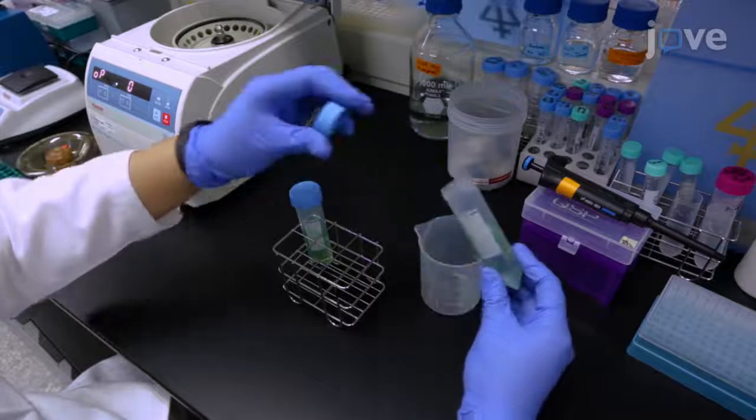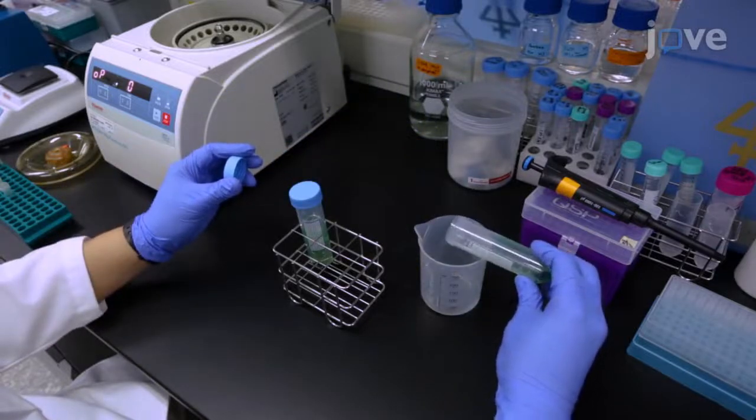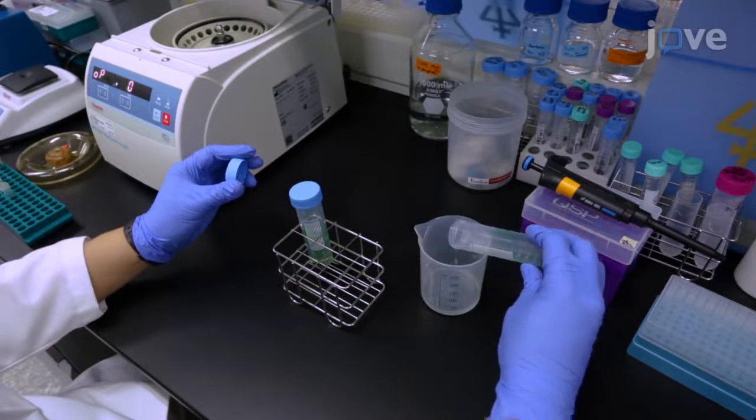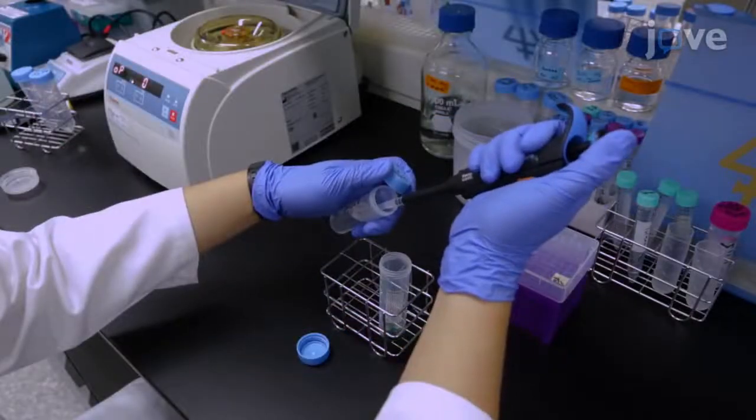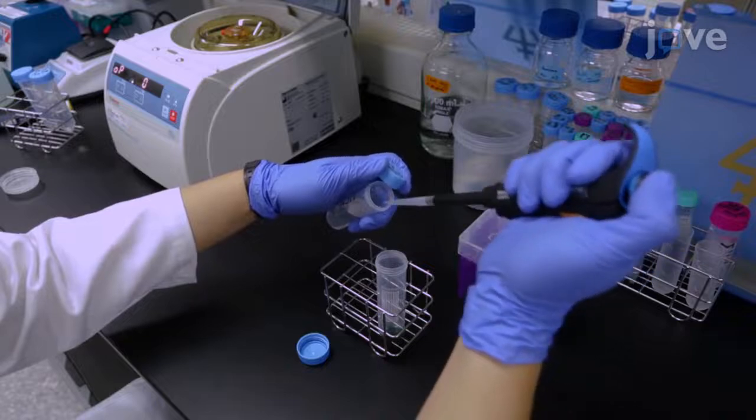Discard the supernatant and resuspend the cells with 0.75 molar potassium phosphate buffer. Measure the wet weight of the pellet by an electronic balance and resuspend the 1 gram wet weight of the pellet in 5 mL of the buffer.